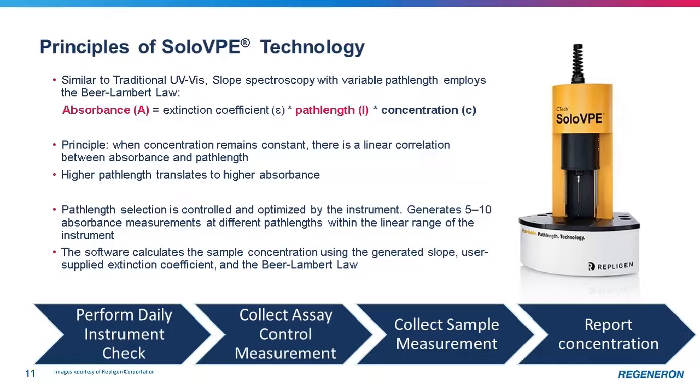As we can see on the slide, we can simplify a QC workflow down to 4 major steps. A daily instrument check would still be performed to ensure that the instrument is set up and operating as intended. An assay control measurement would still be collected as a secondary layer of control to ensure that we meet the stringent QC regulations. However, sample dilution would no longer be required as sample concentration is the constant and does not have to fall within the linear range of the instrument.